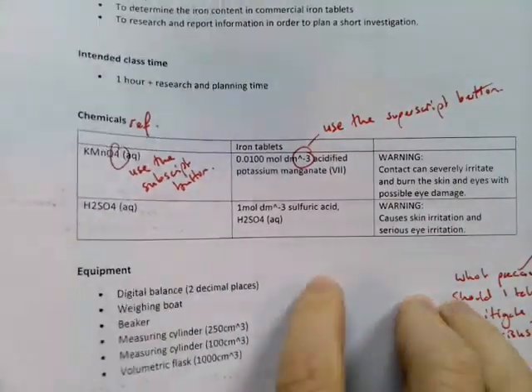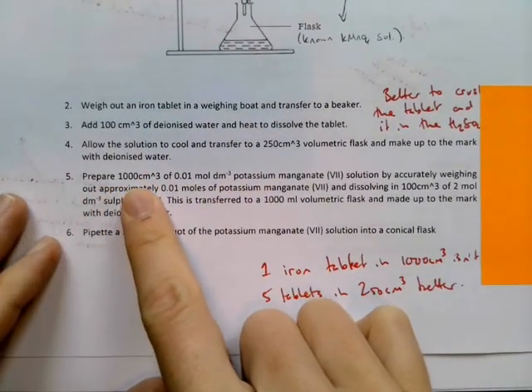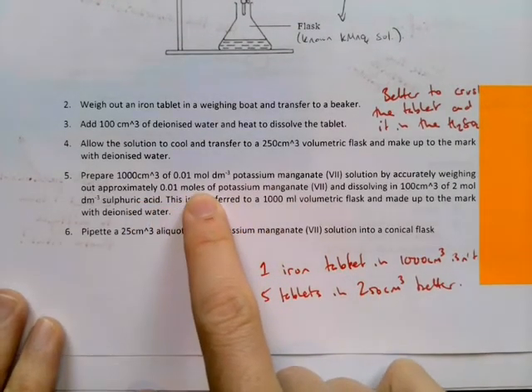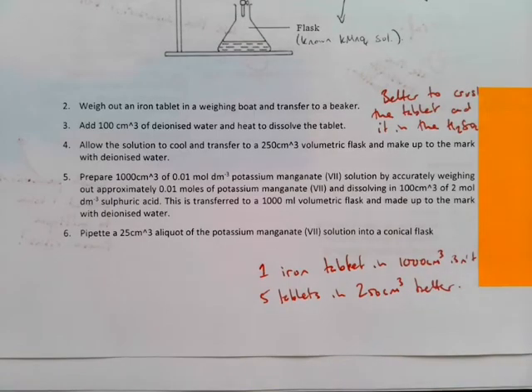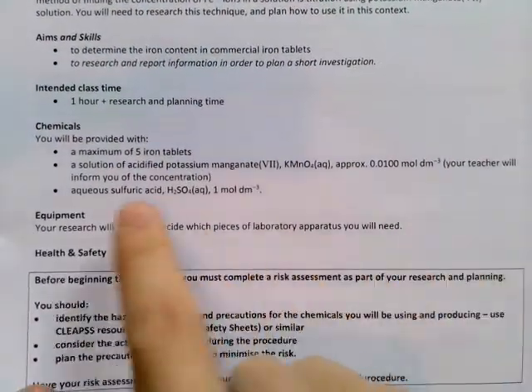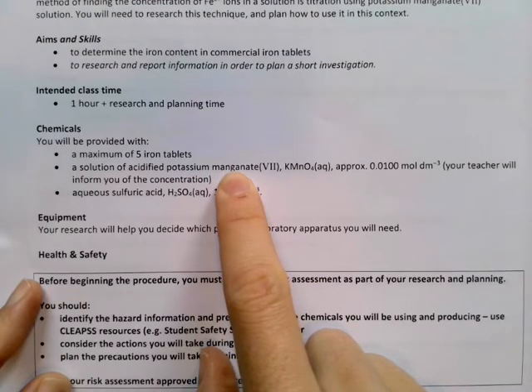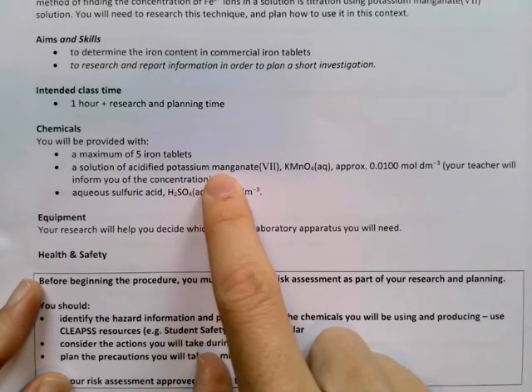Okay, next here. Okay, prepare a litre of the potassium manganate solution by accurately weighing out approximately 0.01 moles of potassium manganate. I don't know how you're going to weigh out 0.01 moles. Weighing scales don't measure moles, they measure grams. But the problem with this is anybody that's done this, it means that you didn't read the instructions that I sent out. Because it says here, chemicals, you will be provided with a maximum of 5 iron tablets and a solution of acidified potassium manganate. So that means that you do not need to make that. All right, so anybody that's included in their instructions how to make the acidified potassium manganate solution, that's not necessary because I'm giving that to you.